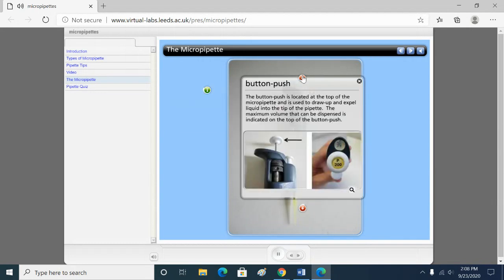One of the things that you experienced, you know that when you push down on the plunger, there are two stops, two points of resistance. So as you're pushing down, you encounter the first stop. If you keep going, then you hit the second stop.